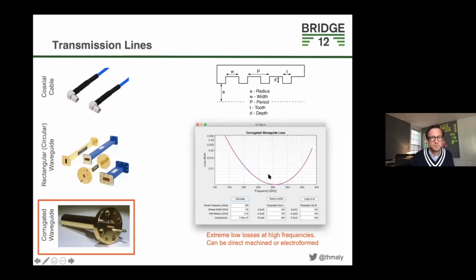I need to say one thing here, one piece of advice to keep in mind. These losses are only true if you inject a pure mode into that. Your solid state device will actually generate a very pure microwave mode inside that waveguide, whereas with a gyrotron, there will be coupling losses. You really have to make sure that the Gaussian beam that is launched from the gyrotron is as perfect as possible, so that you avoid these losses and don't have mode conversion in the transmission line.